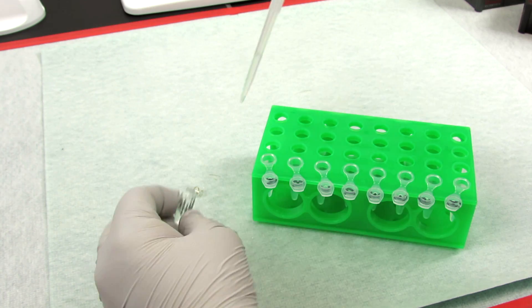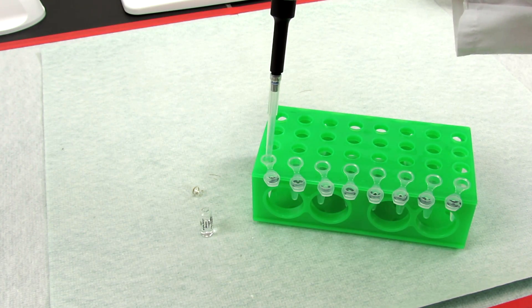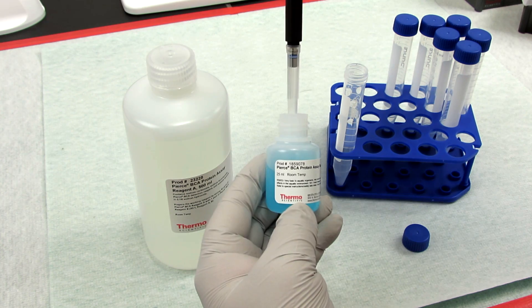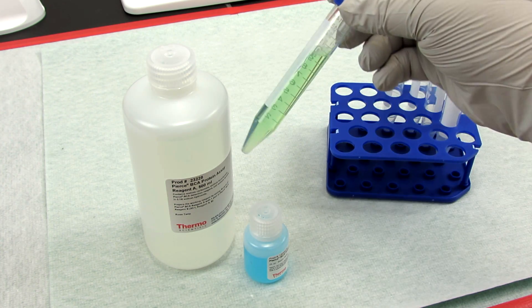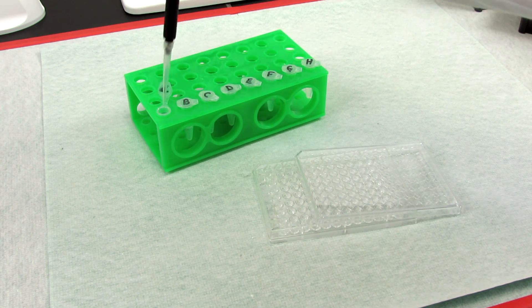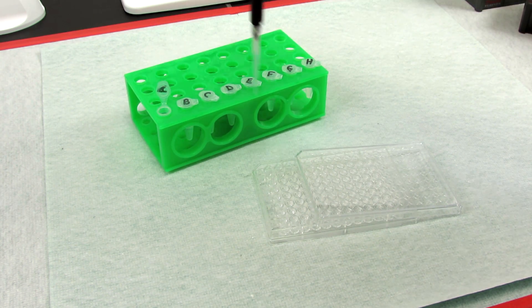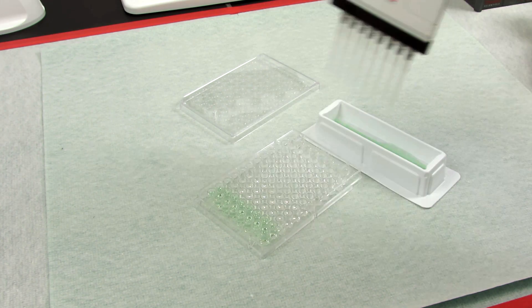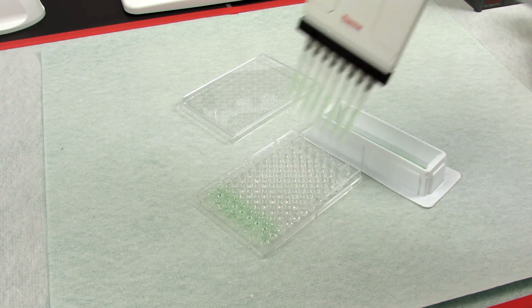After diluting the BSA standard, prepare the BCA working reagent by combining reagents A and B at a 50 to 1 ratio, and pipette 25 microliters of each standard or sample into a microplate well, followed by 200 microliters of the BCA working reagent.